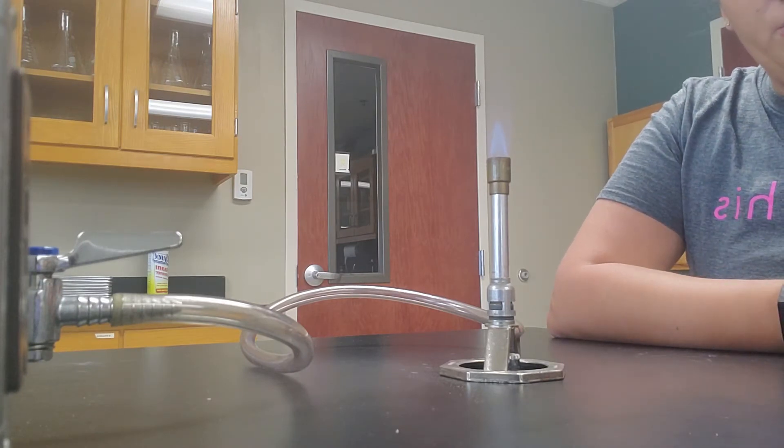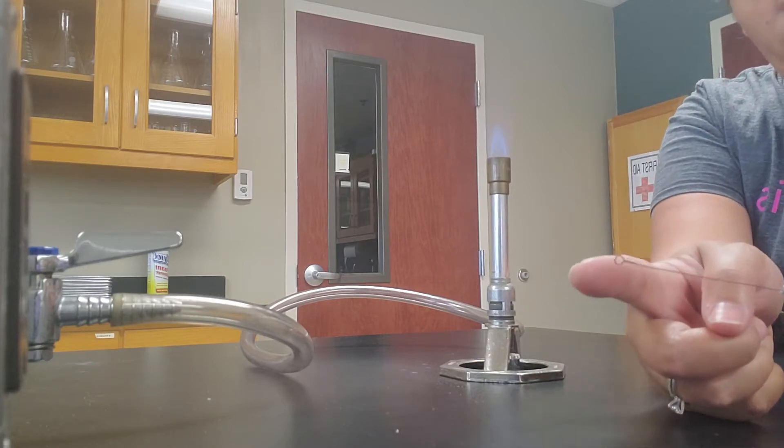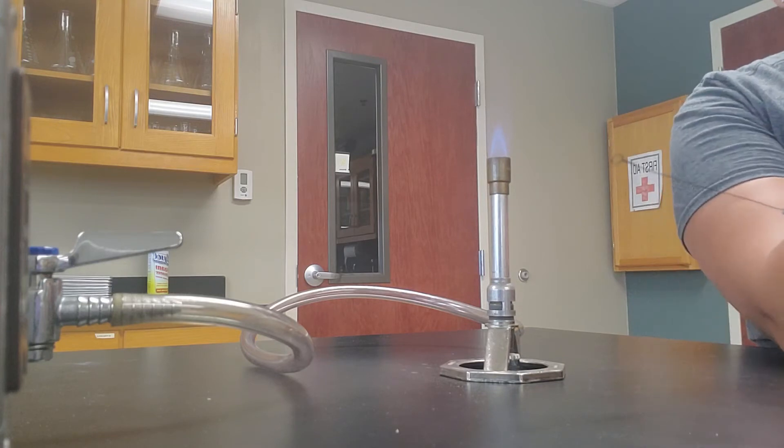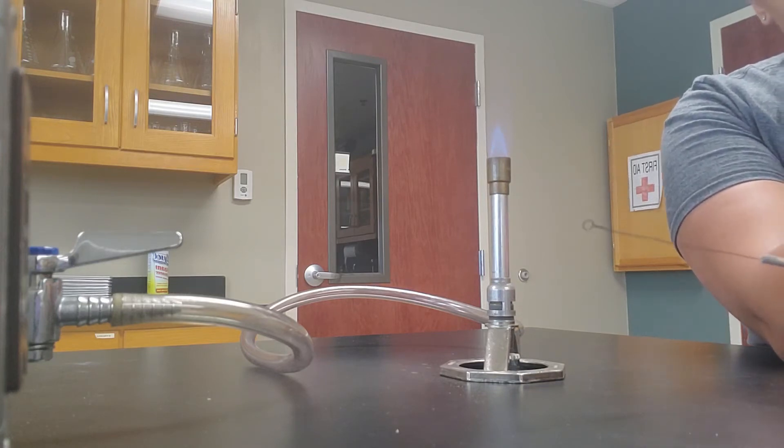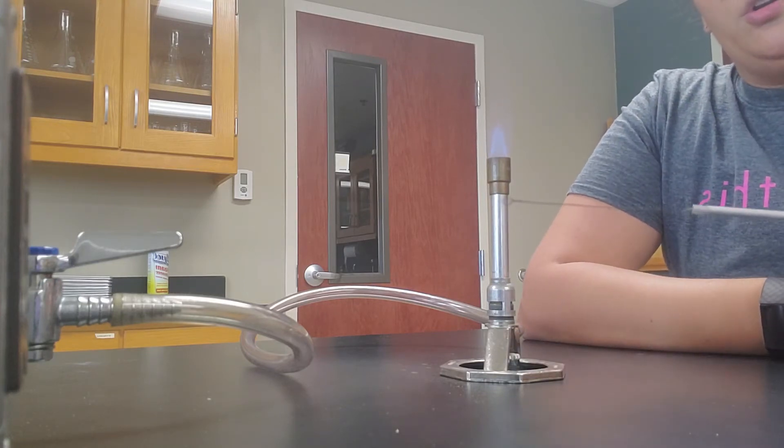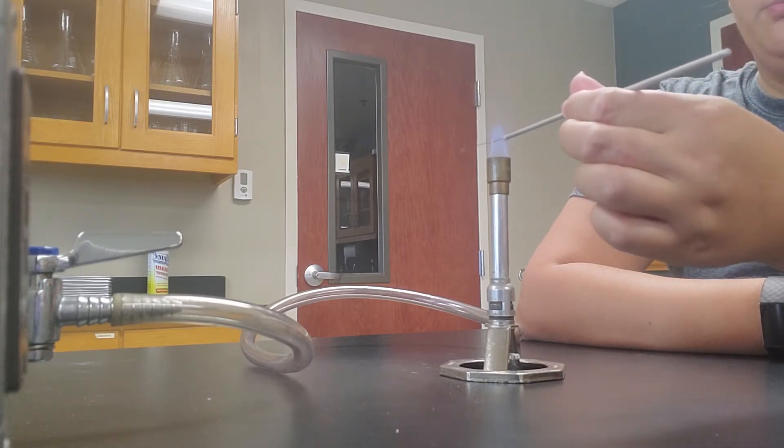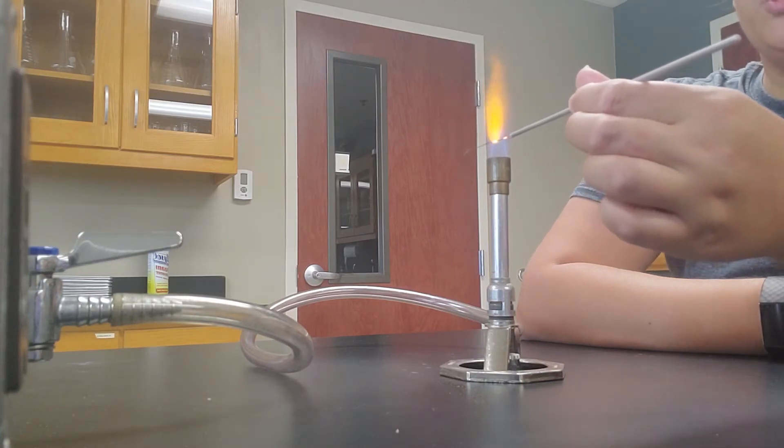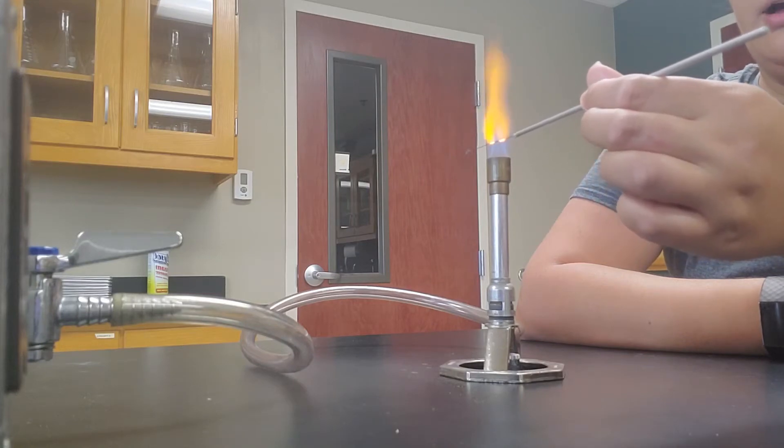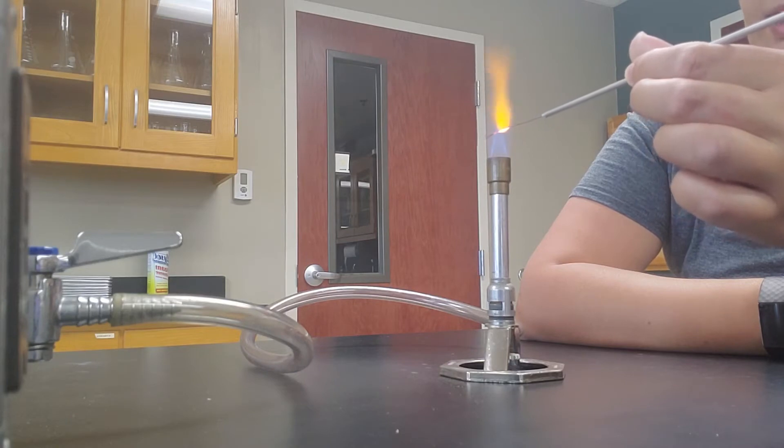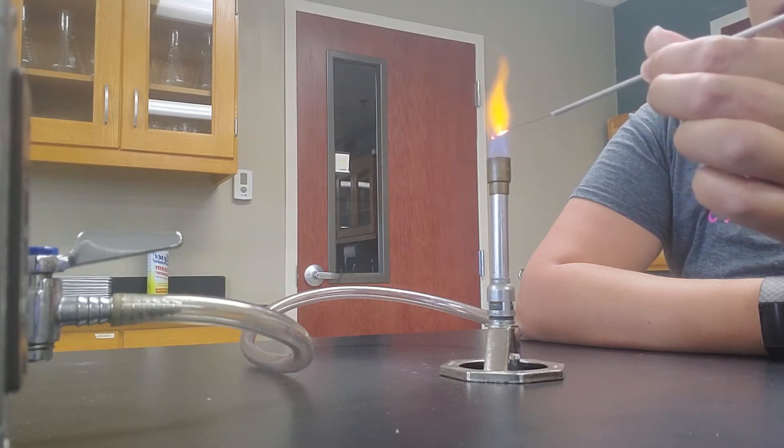We also have inoculating loops. So the inoculating loops here, basically they're a little round thing at the tip. So whenever you do aseptic technique, you want to make sure that you're transferring things without contamination. So the first thing you want to do is actually flame your loop. And you start kind of at the base and move toward the loop, and you'll notice it gets kind of that hot, really hot color, that kind of orange color. And you want to do that all the way to the tip.